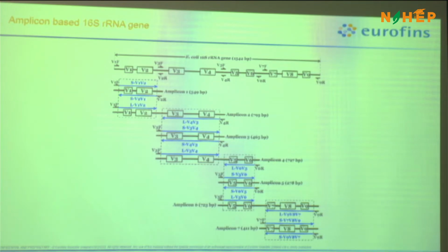But if you want to do a screening study, you have huge samples, V3, V4 is a good one because we are just making our subset very small and trying to fetch out whatever is present in the particular abundance. What are the bacteria, what percentages they are present, and how they are present. So there are two different technologies or approaches which we can take in 16S amplicon. One is long read and one is short reads.